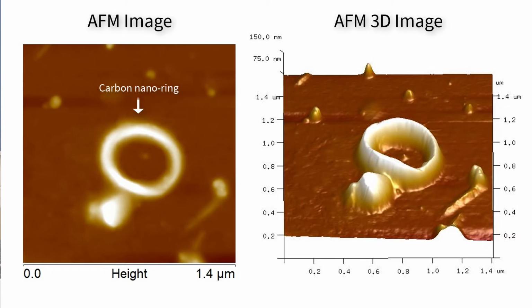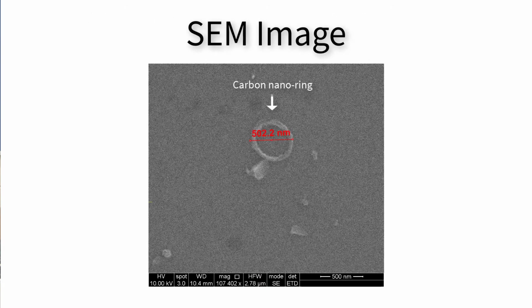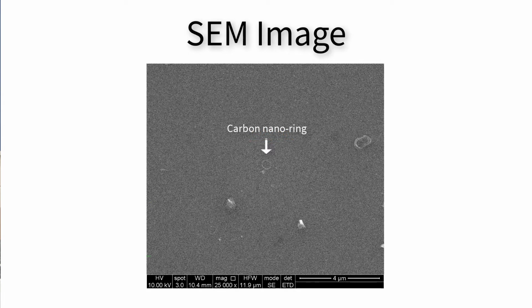So how is it possible to image structures so small on separate instruments? While it does require skill and patience, it is conceptually surprisingly simple. The nanostructures we are studying are carbon nanorings produced in the Vortex fluidic device, which was developed by Professor Colin Raston. Apart from the carbon nanorings, other materials such as small pieces of silicon and nanotubes are also present on the surface. We can use this material as markers to locate and relocate structures on the sample surface, as can be seen in the image where markers are indicated by arrows 1 and 2.